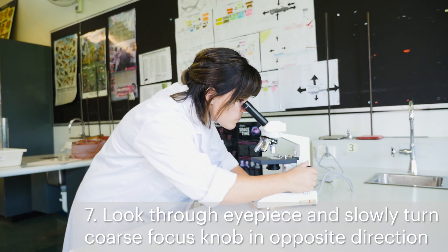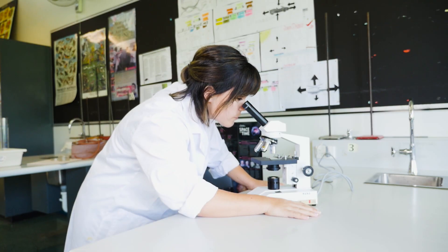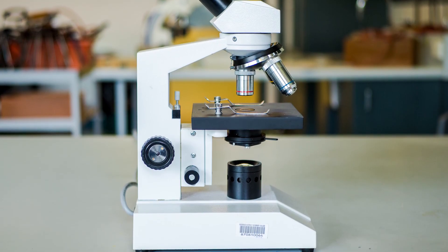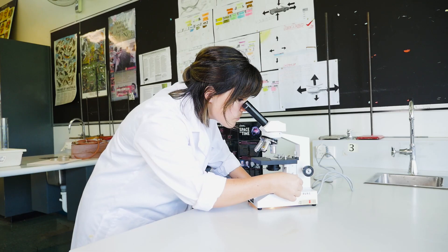Now you can look through the eyepiece and slowly turn the coarse focus knob in the opposite direction to focus on the specimen. If you turn the knob too quickly, you might miss the moment when the specimen is in focus. Once the specimen is roughly in focus, you can use the smaller fine focus knob to get a sharp image.